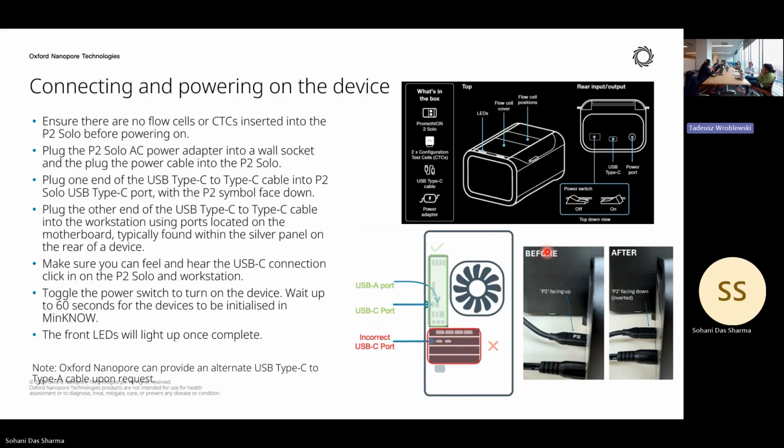Those are not high output flow cells. So if we are dealing with whole genome sequencing or even RNA, those are not the best platform. You can always use it, but the data output would be less. For some labs, probably that is enough. But usually for whole genome sequencing, when we do analysis, we want deeper data, right? You won't get it from the MinION. But for microbiology labs and virology labs, I think the MinION is enough.